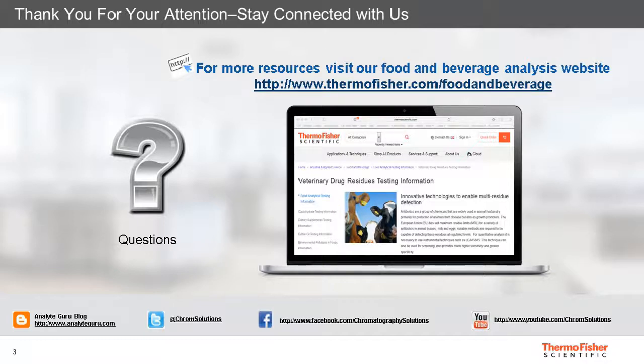Simply, we don't top up the water, because if you keep topping up the water, then that gives an opportunity for microbial growth, which will contaminate the system. Other things we do is we monitor the performance of the electrolytic suppressor, which is placed after the column, in the software. And from the data that you get back, you can get an indication of when it's necessary to clean the suppressor. It's very straightforward to do. It just takes a few minutes.